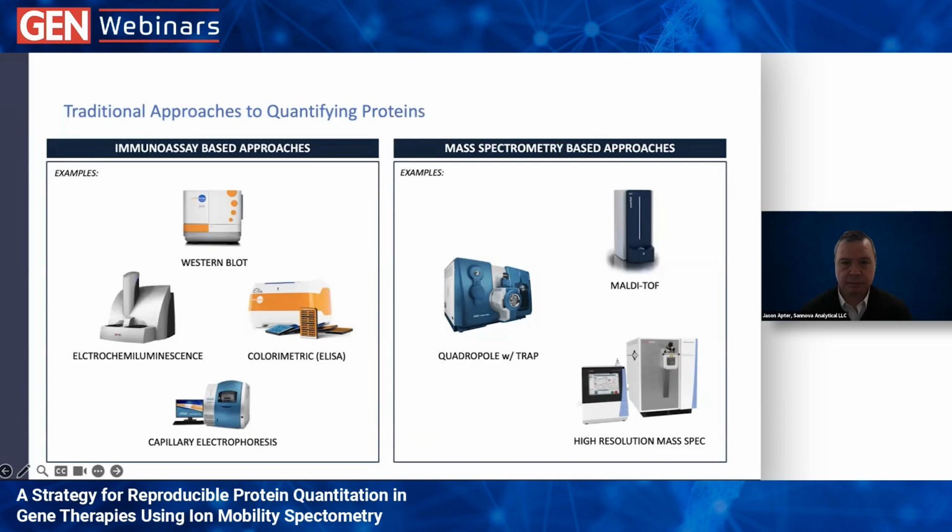it's the same every time. Within some limitations, basically you have the advantage of being able to synthesize heavy stable isotope labeled reference standards. And so you can get a real good sense of the reproducibility. And if there is a change of some type, you will pick it up. And so we show here a few relatively modern mass specs.